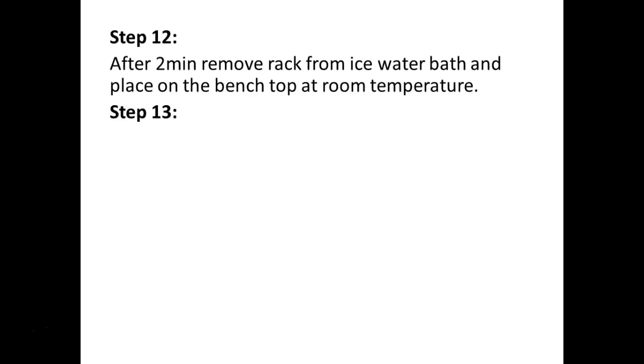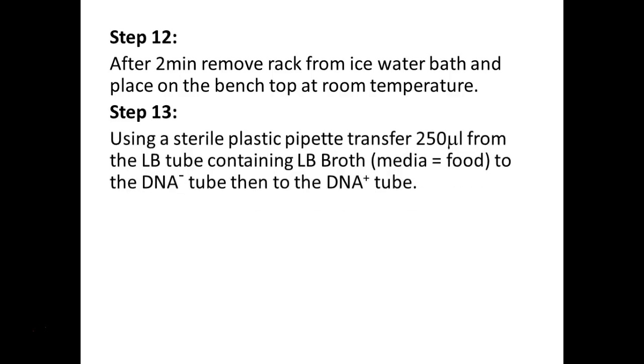Okay, so 2 minutes. After the 2 minutes, then you're going to just take that white rack out and put it right on your bench top. The next step, I'm going to give you a little tube that contains 500 microliters of LB broth. It's food for your bacteria.